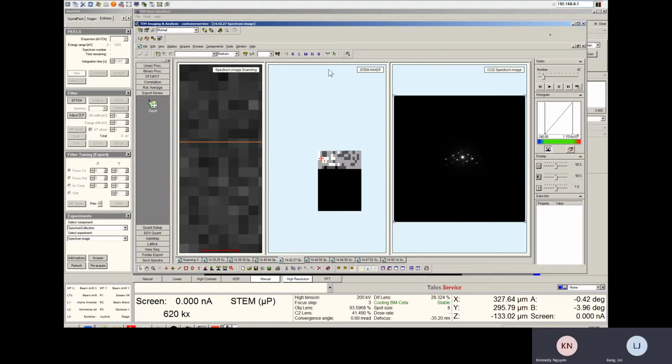Okay. You want to do a little practice on this one? Sure. Okay. Let's do it with DF4, because you guys have DF4, right? Yeah. So first, you're going to do acquisition using the DF4 with the detector, and then you do that without the detector.